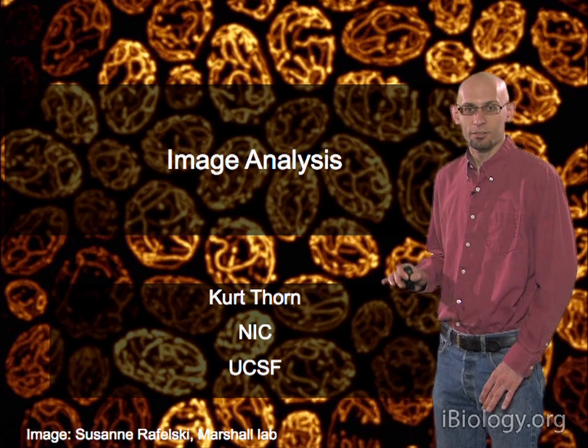But equally, you can generate those numbers by taking this top row and duplicating it, or wrapping around so that the top row is connected to the bottom row, and then you would get your numbers from there. And I think that's what was done here.